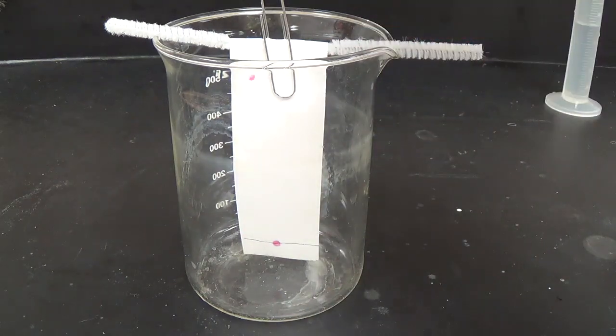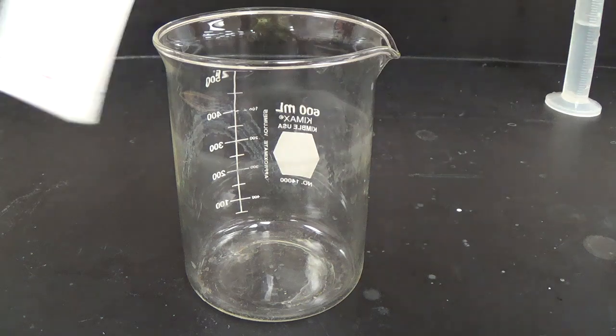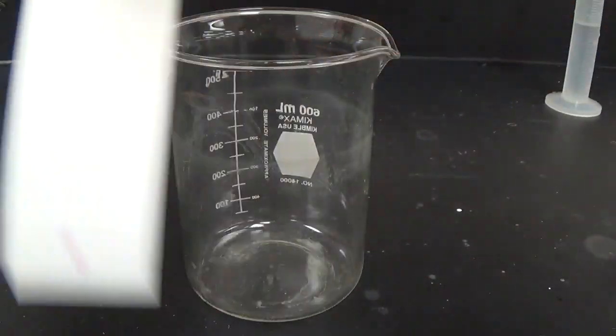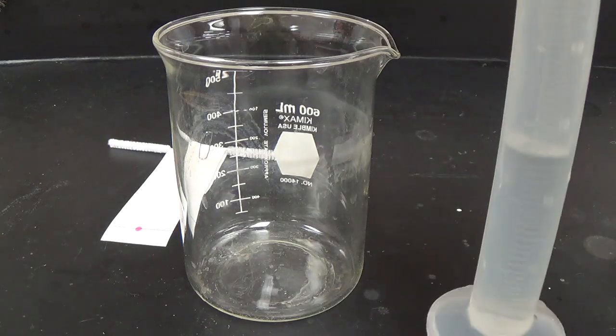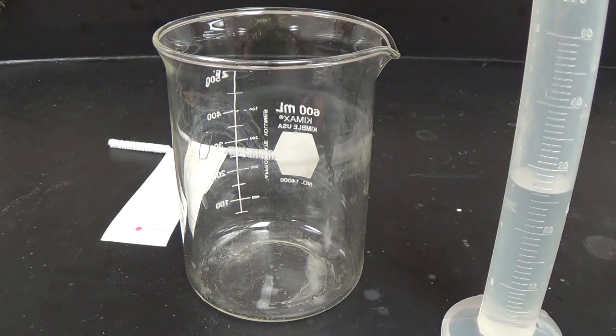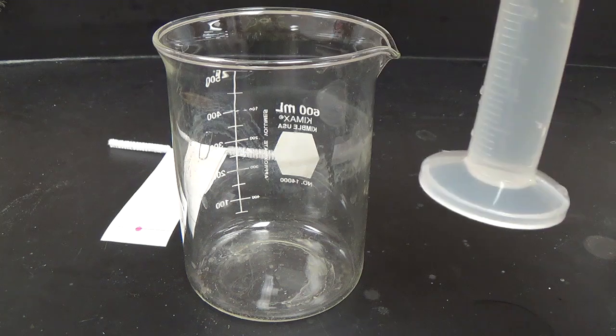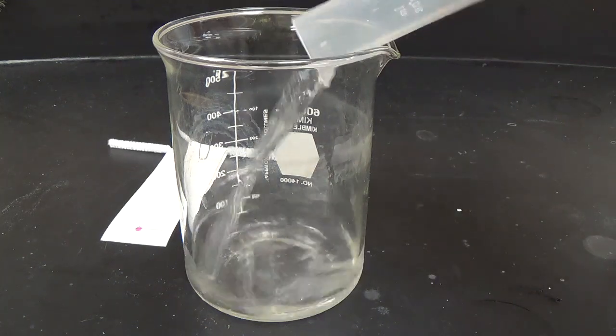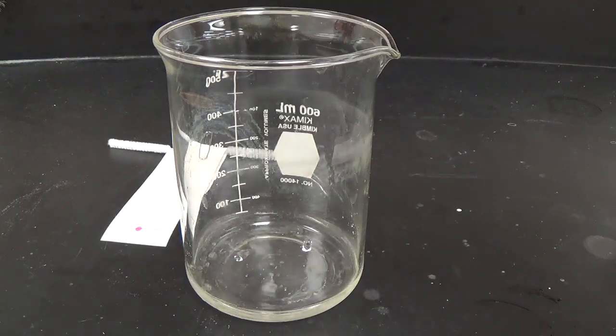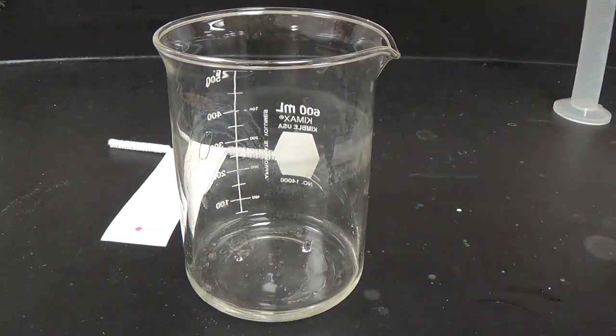Okay, I'm going to now take my stationary phase out. This is my stationary phase, the paper, and I'm going to add my movable phase. With what we're going to separate, I know it dissolves in water, and when you realize what we're going to be using, you're like, well, duh, yeah, because we use water to mix it up. So I'm going to take water, about 25 milliliters of water, and that is stated in the lab, and I'm going to pour that in. Now I have my movable phase in the beaker.